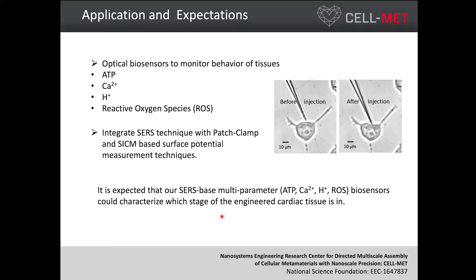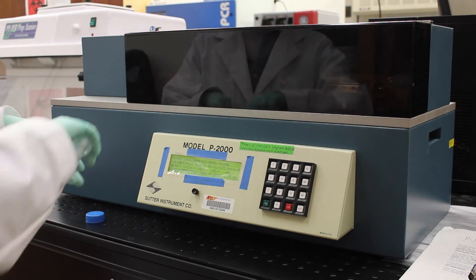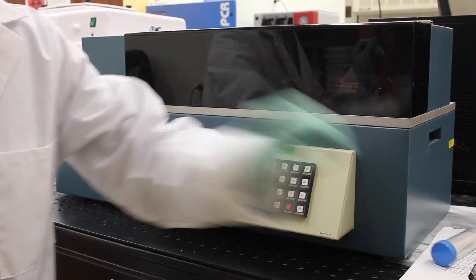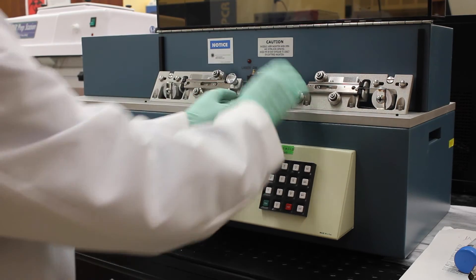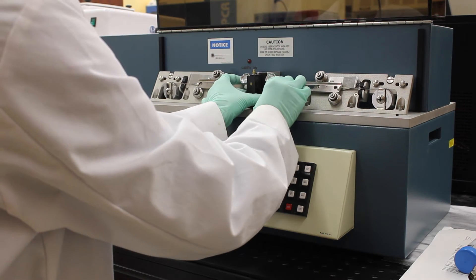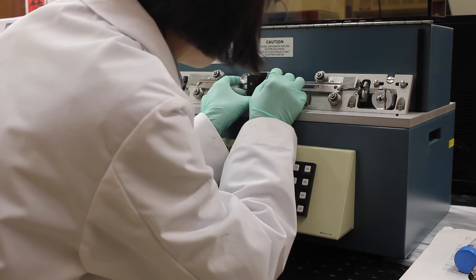This is our laser puller. Let's first turn on the power. This sets the parameters — different parameters give you different apex sizes and different lengths of your glass pipette. This is our capillary; inside is empty. Now we install and fix the capillary inside the laser puller. Each capillary can give us two glass nanopipettes. Now use the screw to fix it. The laser is in the center, so it can hit the glass, and once you pull it, it will deform and form the nanopipette.